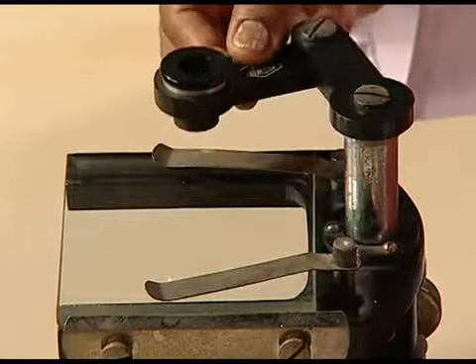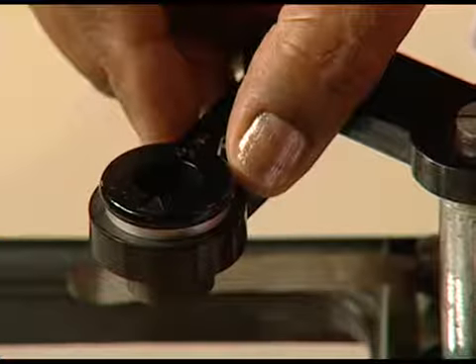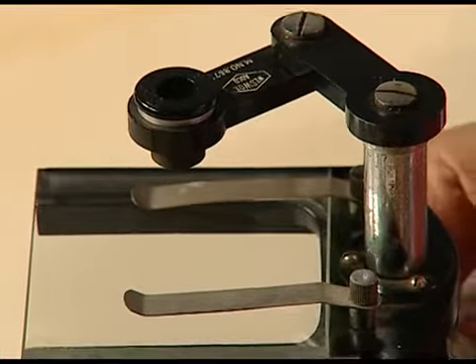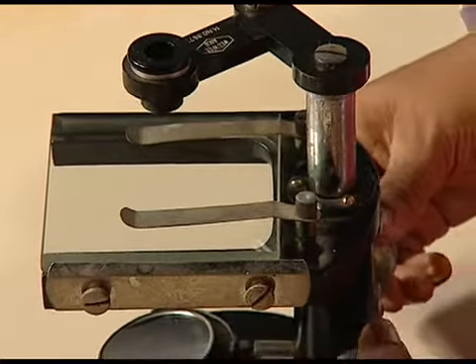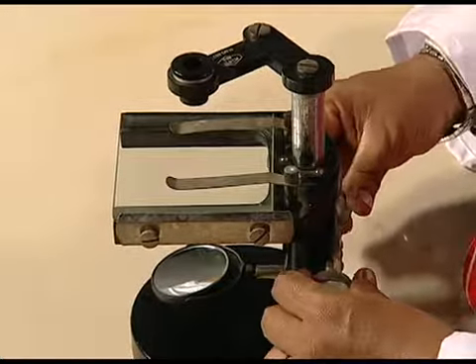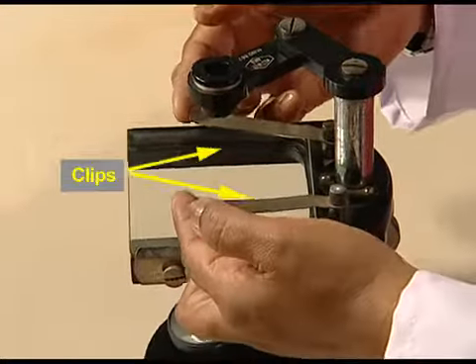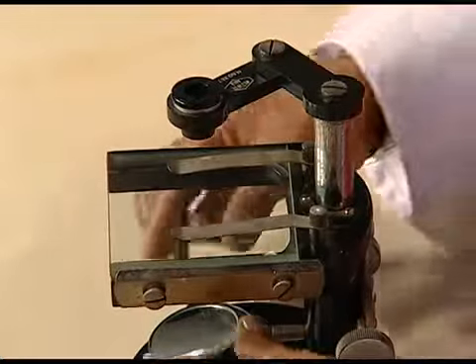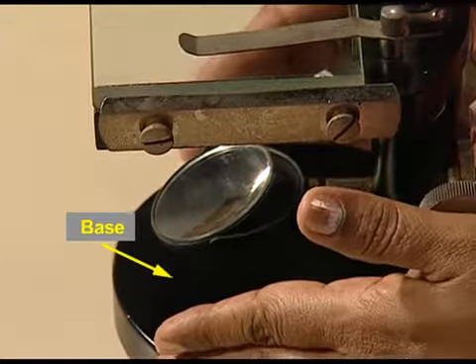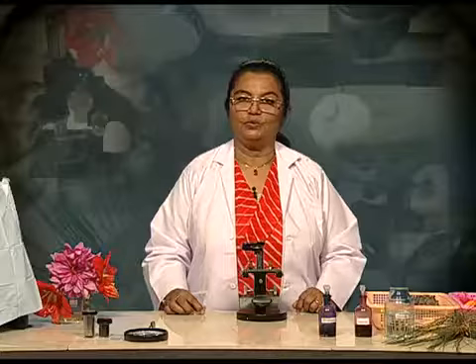Next, we can see a folding arm. It has a folding arm to position the lens right above the object. Then there are the adjustment knobs to move the lens up and down for focusing. There is a stage made up of glass, 2 clips on the stage, a reflecting mirror, and the base. Let us see now how to use a dissecting microscope.